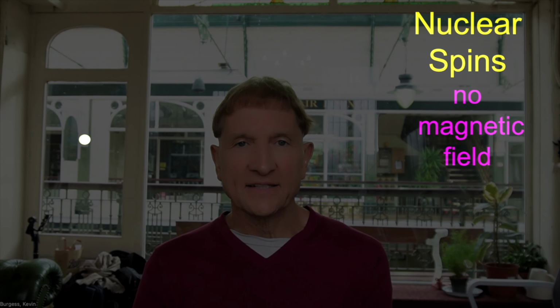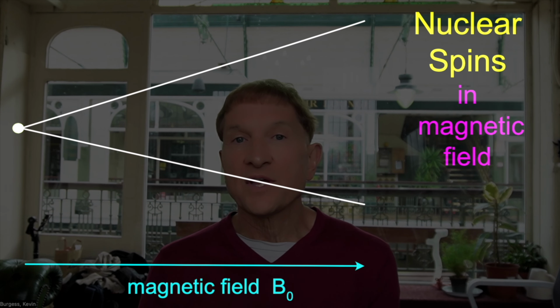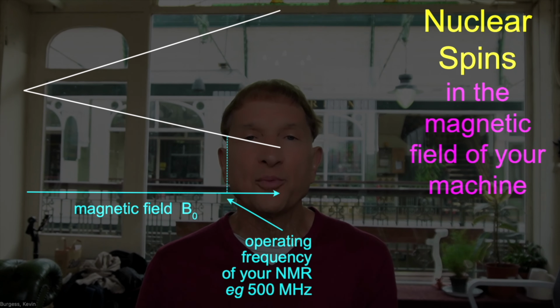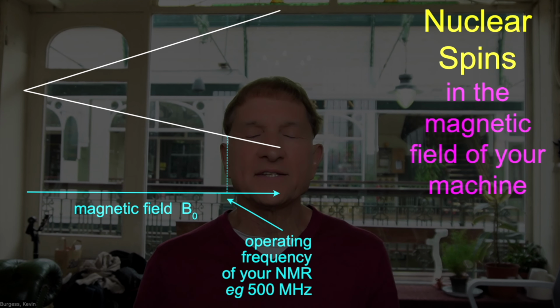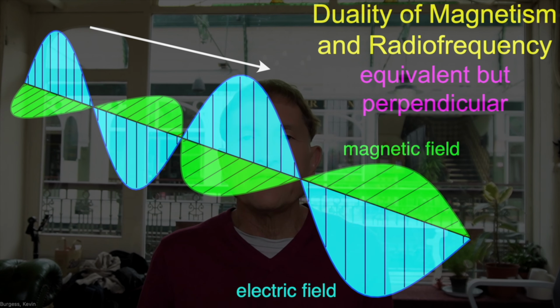That's why NMR machines have big magnets. This increases the delta E, that increases the population difference, and that increases the absorbance of the signal. The sensitivity of the machine is proportional to that absorbance signal. Nuclei can be flipped between their aligned and opposed states by applying a perpendicular magnetic field. That perpendicular field can be a radio frequency pulse because radio waves generate magnetism as they travel.